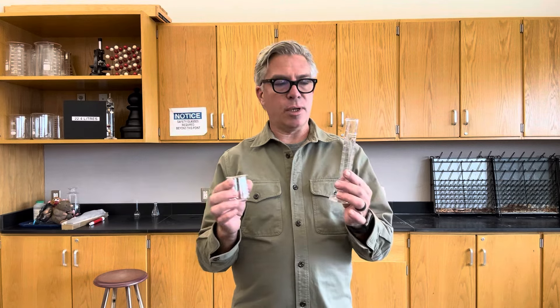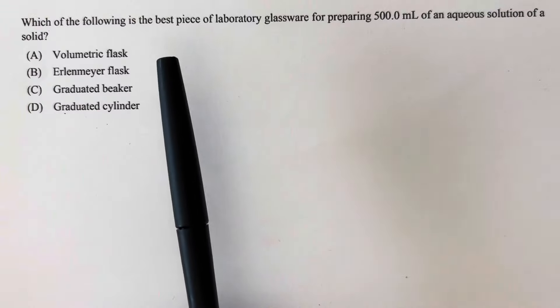Some glassware is made for preparing solutions accurately, some is made for dispensing pre-made solutions accurately, and others are not really worth your time unless you don't care about accuracy and just need to dissolve something. Each piece of glassware has little markings indicating the volume if you filled it to that line. You would think they would all be correct, but sadly they're not. If you use the incorrect one, you're going to get an incorrect solution.